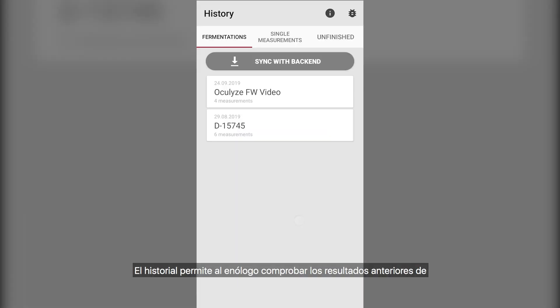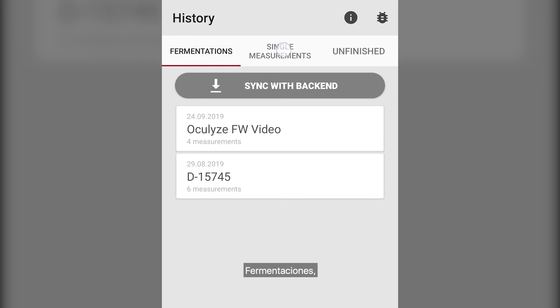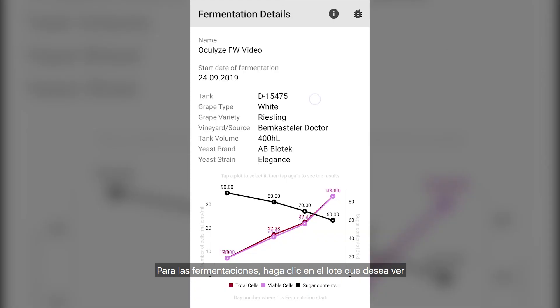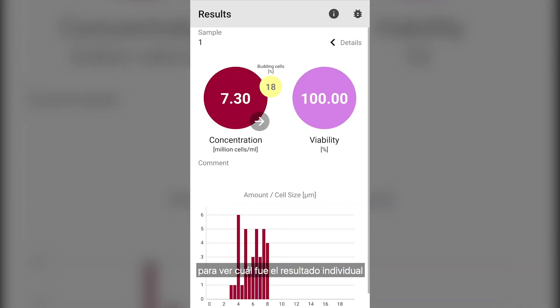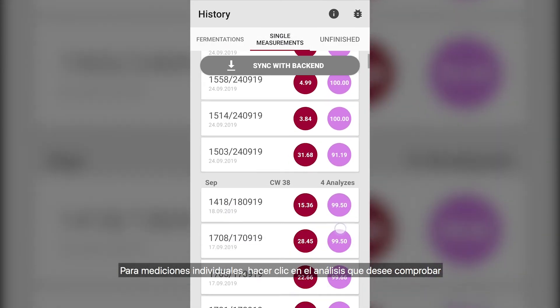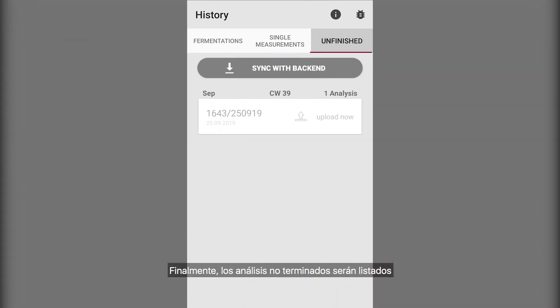The history enables the winemaker to check on past results of fermentation, single measurements, and unfinished analyses. For fermentations, click on the batch you would like to see — there you can see all the details of what went into the batch along with a graph which plots your concentration, viability, and sugar density from start to finish. Simply double-click on the analysis to see the individual result. For single measurements, click on the analysis you want to check on. Finally, unfinished analyses will also be listed.